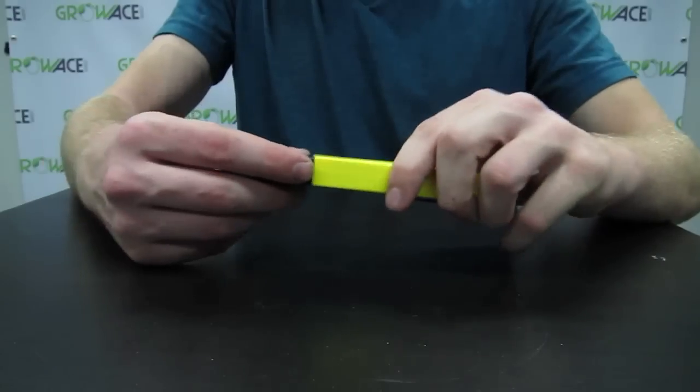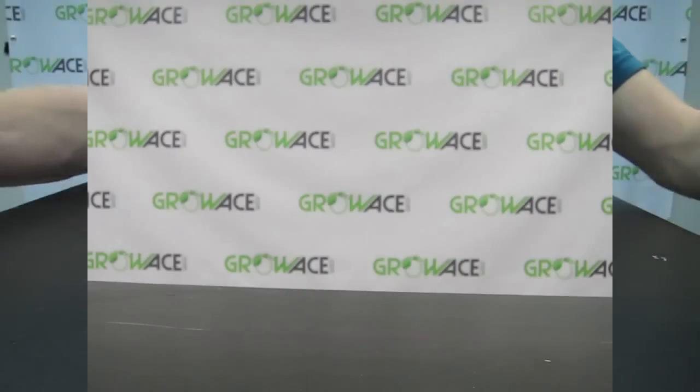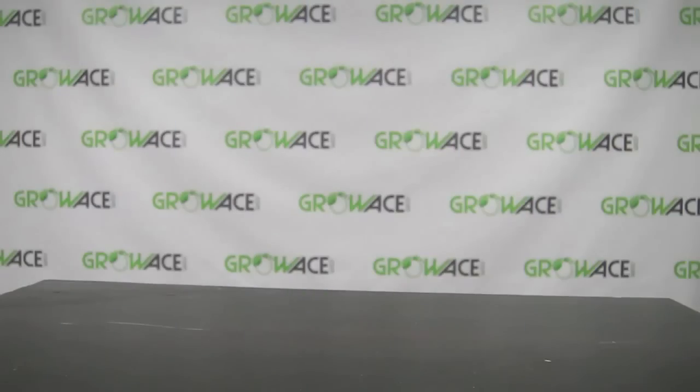Alright, let's calibrate this pH meter. It's important to calibrate your pH meter the first time you receive it for an accurate reading.